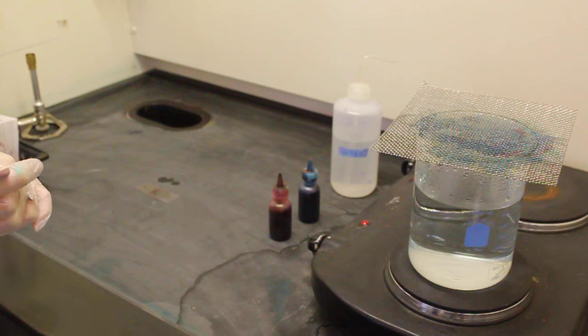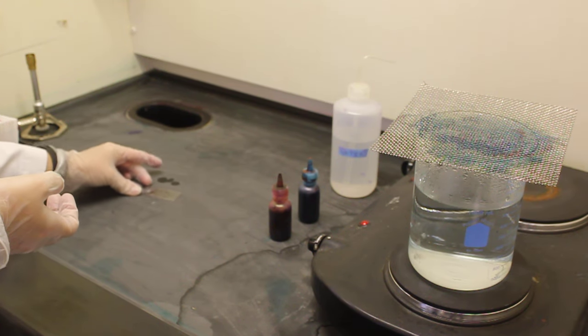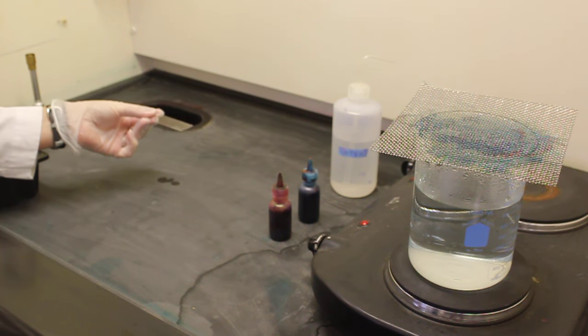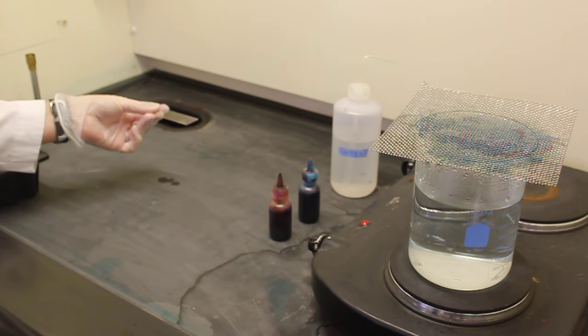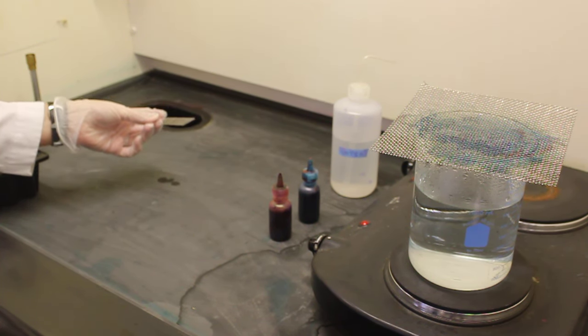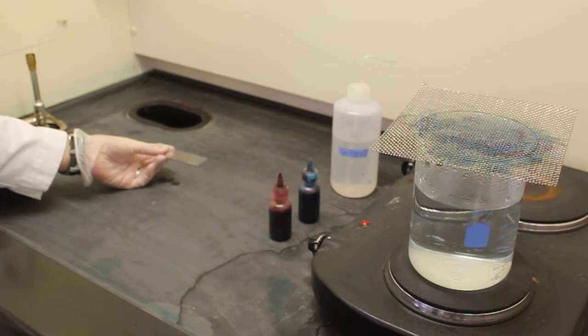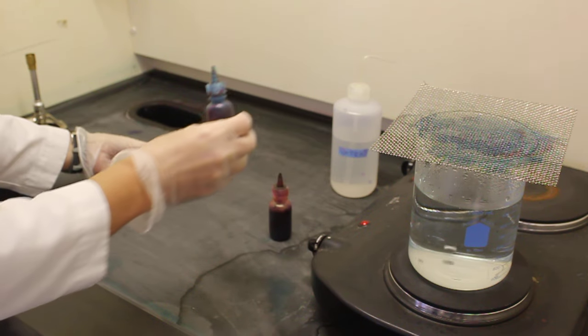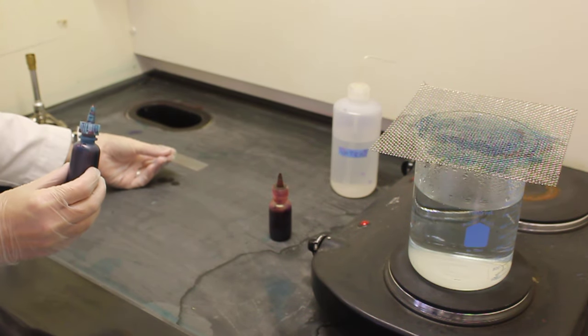To begin our staining process, we must begin with a smear that has been heat-fixed. This was completed before the video began. The first step of the endospore stain requires the addition of the primary stain, malachite green.